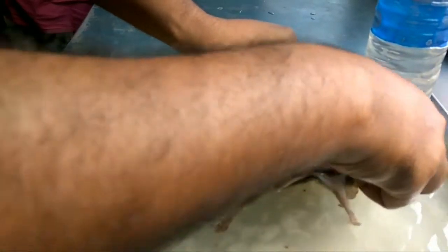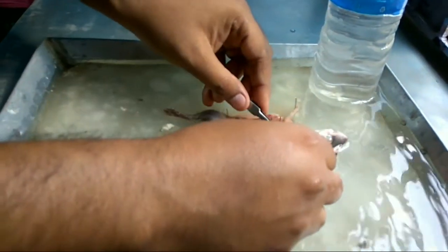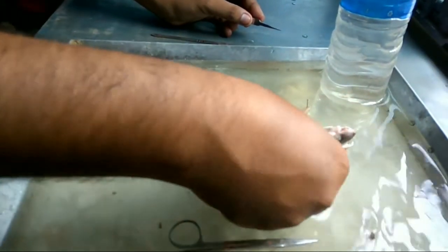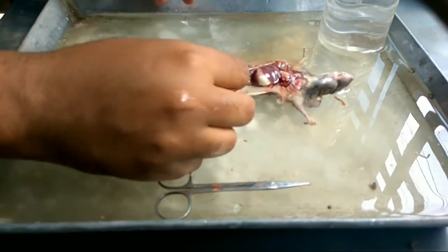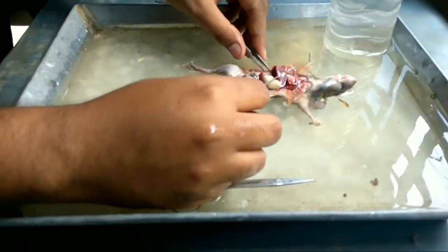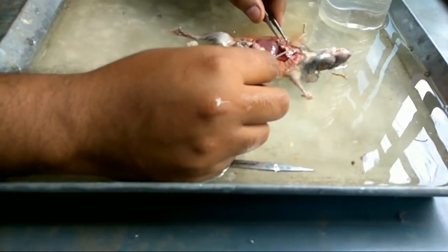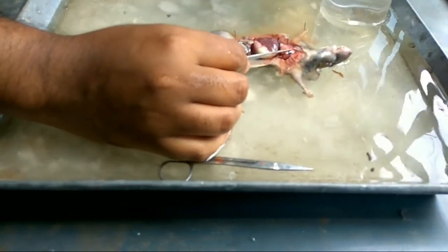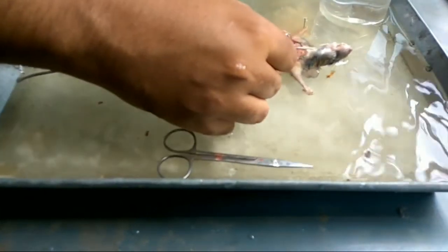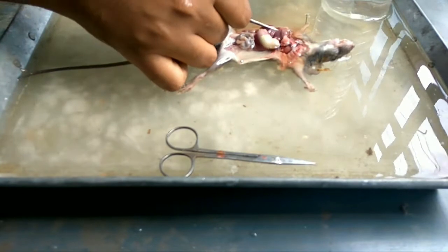Hold the ribs and pin through them. The pinning procedure is now complete. I'm going to show you the different organs inside. These are the lungs — the pinkish ones — and just below the lungs you can find the heart.